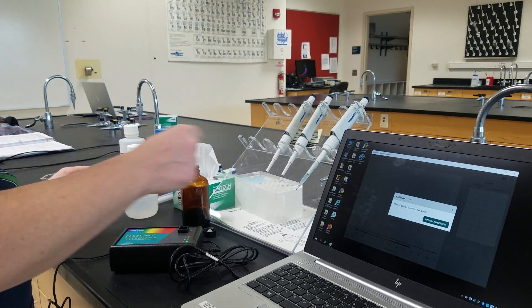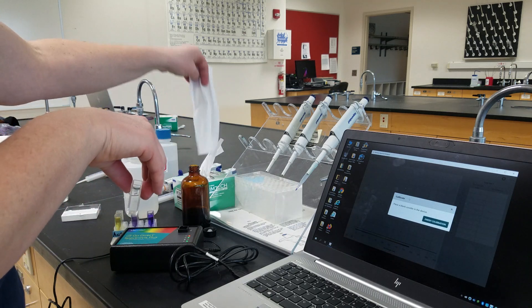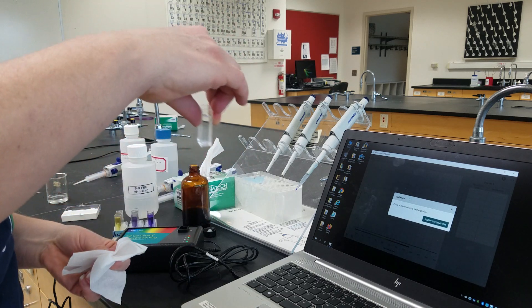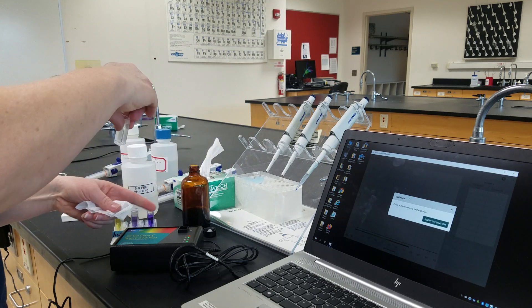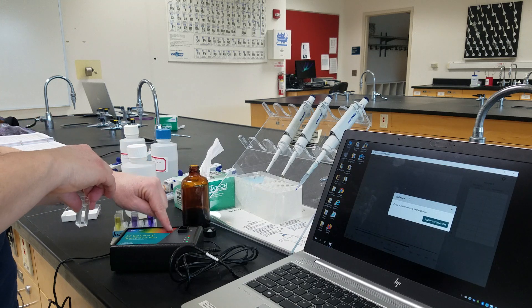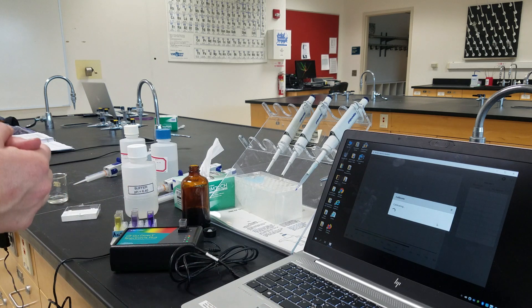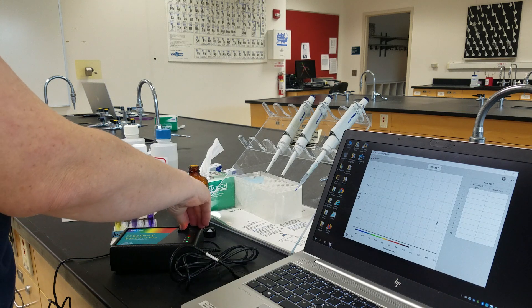Now that our software has warmed up, it says we want to place a blank cuvette into the device. I've filled a blank cuvette with water. We want to make sure the clear sides of the cuvette are lined up with the lamp — the lamp is on this side and the detector is on the other. We click Finish Calibration, and the instrument is done calibrating.